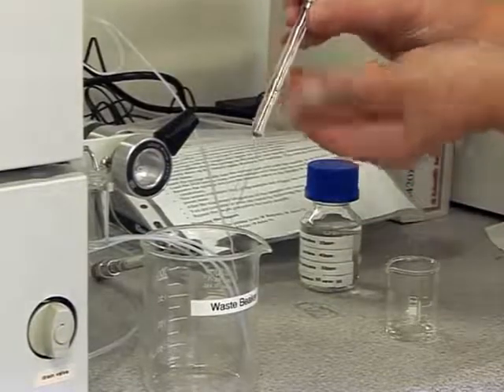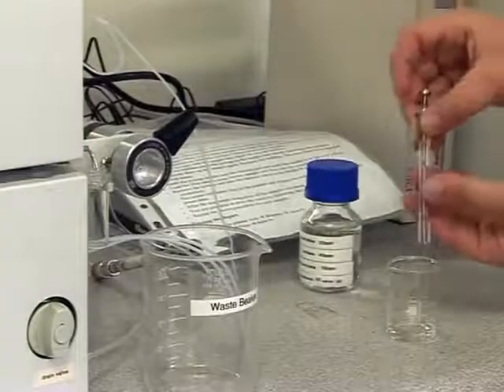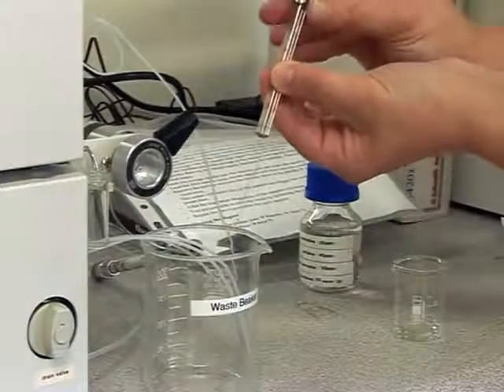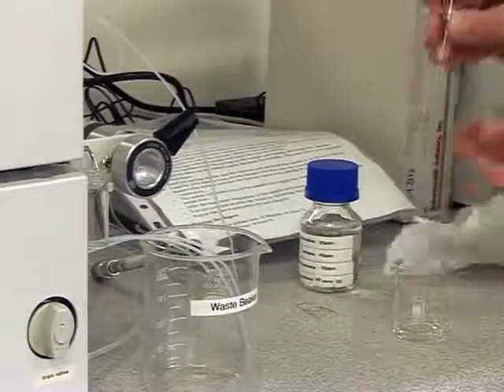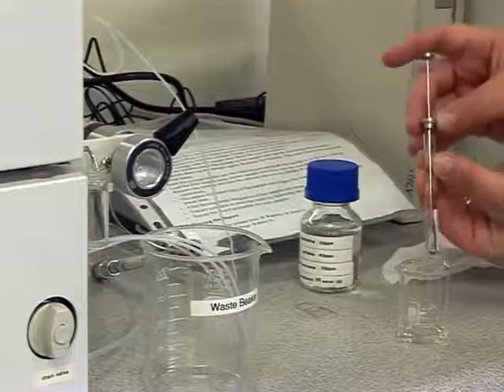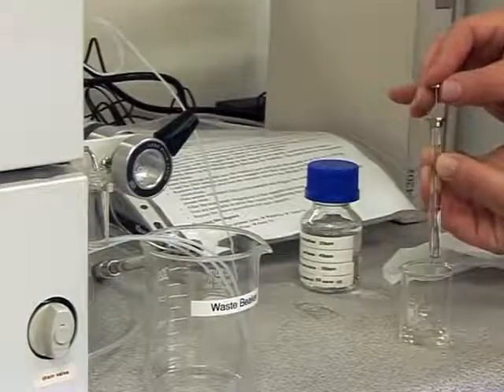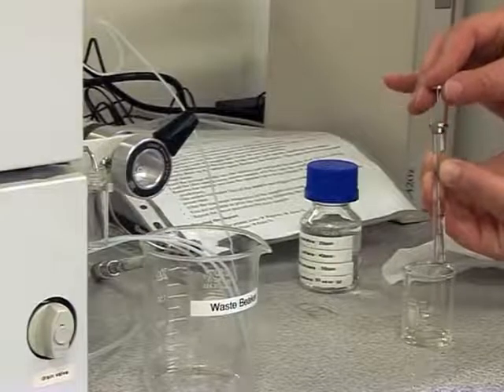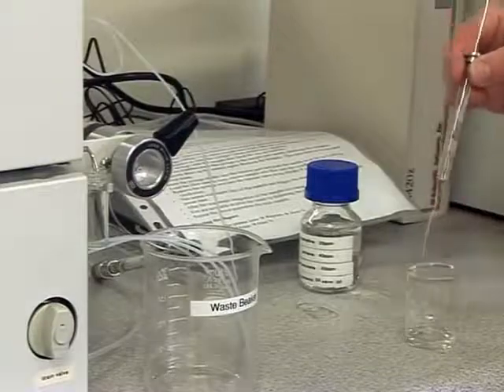Draw up approximately 50 to 60 microlitres again and check for air bubbles in the syringe. If there are air bubbles evident, you need to remove them as they will cause interference in the analyses. To remove air bubbles, place the tip of the syringe into the solution and push the plunger down quickly. Draw up the solution slowly, and if the air bubbles are still there, push the plunger down fast again. Repeat this process until the air bubbles have been removed.